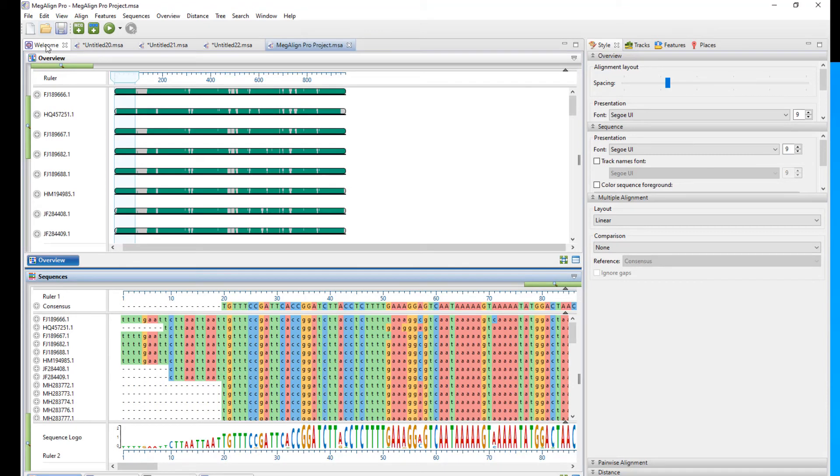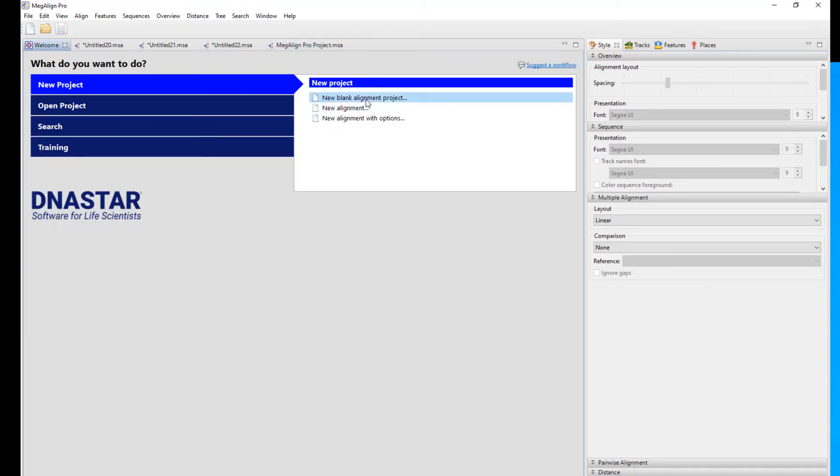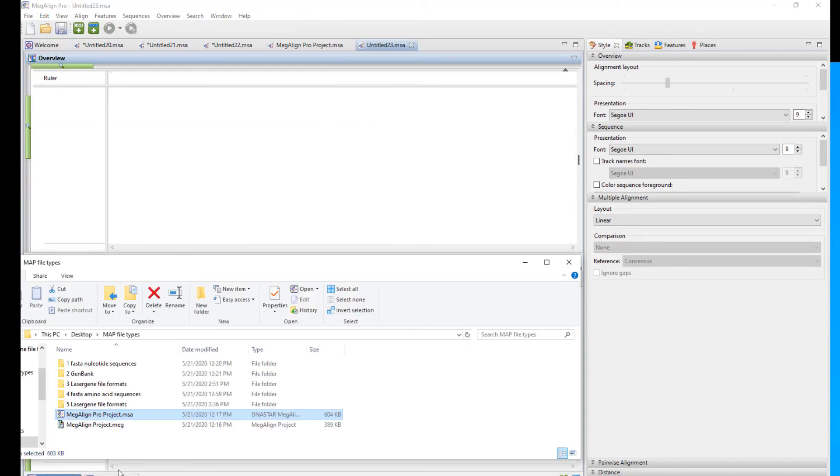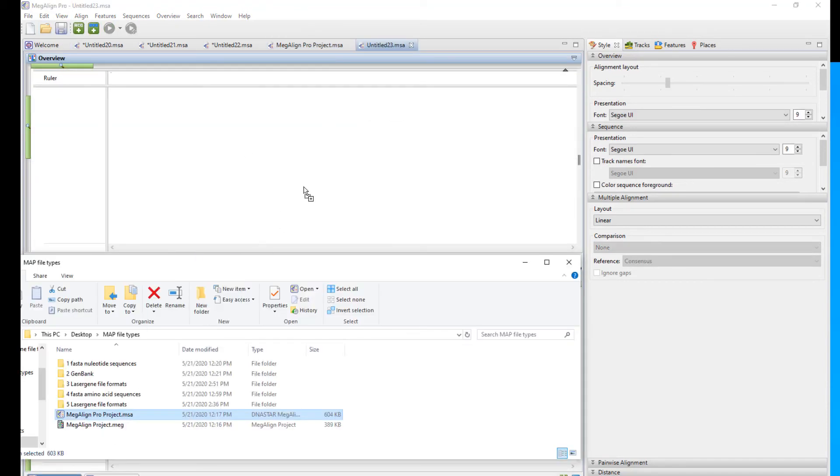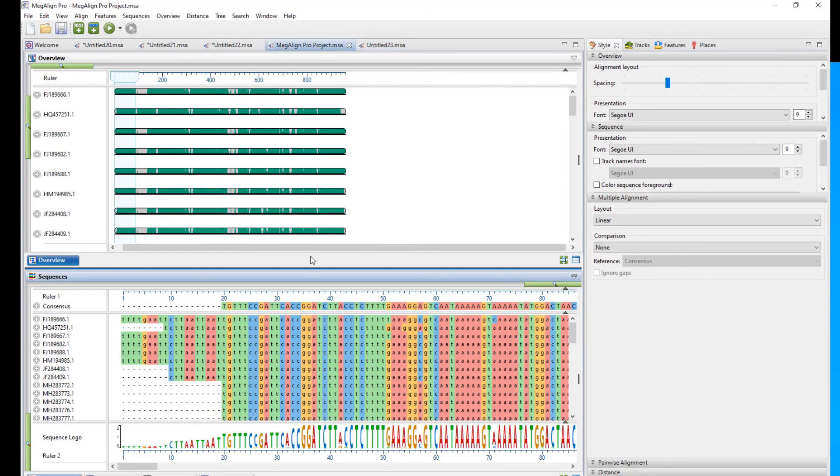Or if you already have a blank document open, they can similarly be drag and dropped at this phase.